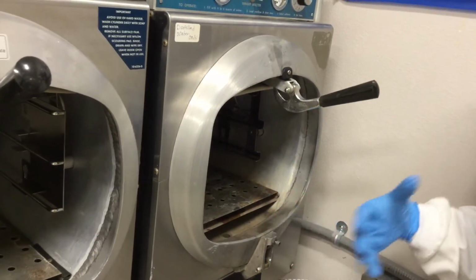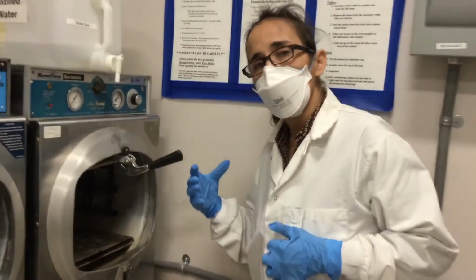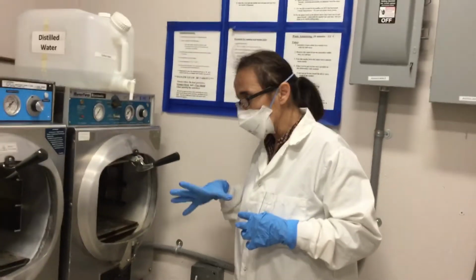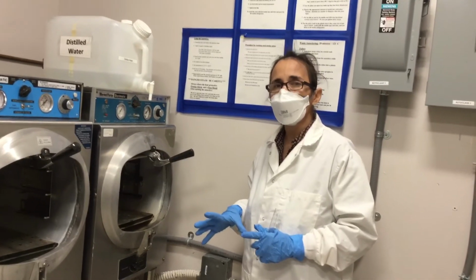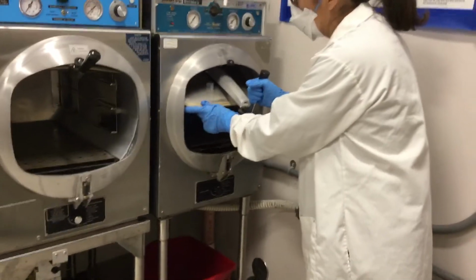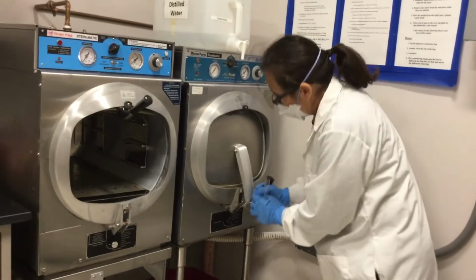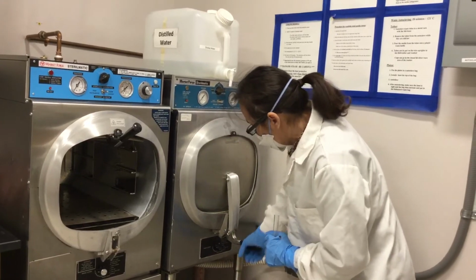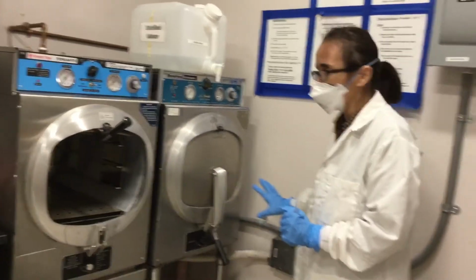This water, with the high temperature and the pressure that you build inside, is going to create a moisture environment, which is going to penetrate into the inside of the tubes. It's going to melt the agar, and it's going to kill all forms of microorganisms, making it sterile. And then you have to close the lid, which has a seal, and you pull it, and then it has this little clasp that goes into this metal holder, and then you push all the way until you feel resistance, meaning that you seal your chamber.